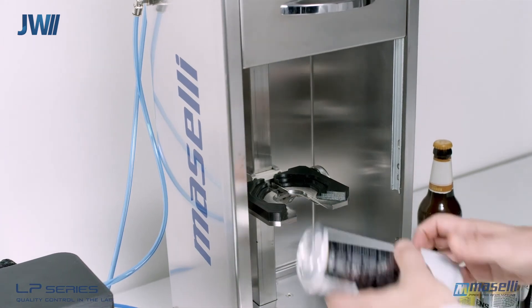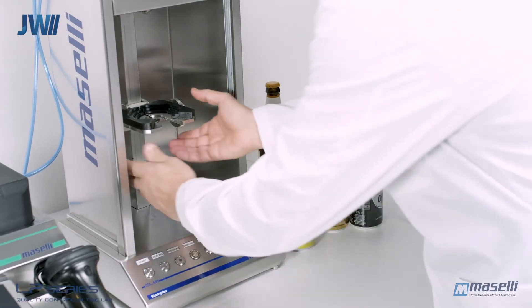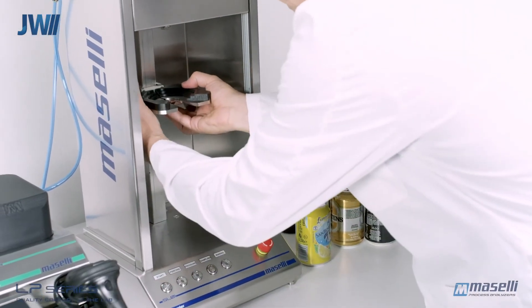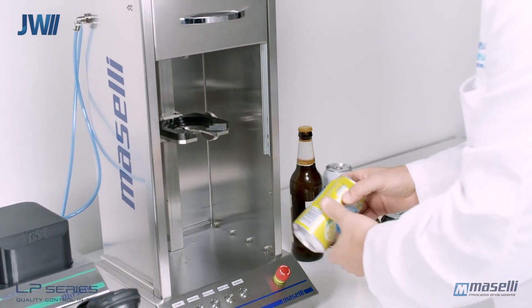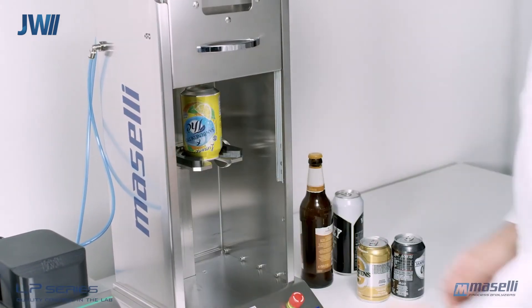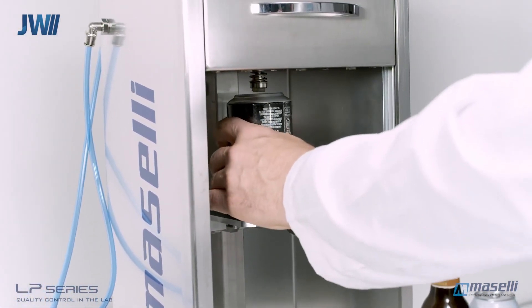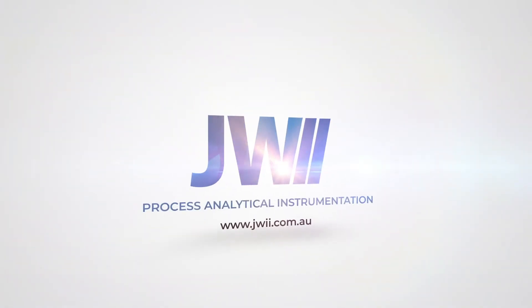The sampler is universal and can also be adjusted for canned products, as well as PET and glass containers of various diameters and heights. If you would like to know more, please visit our website.